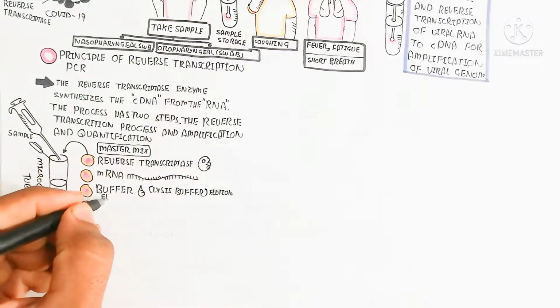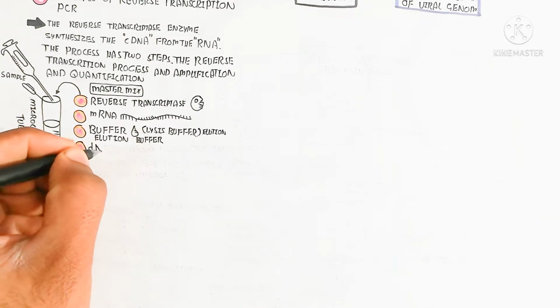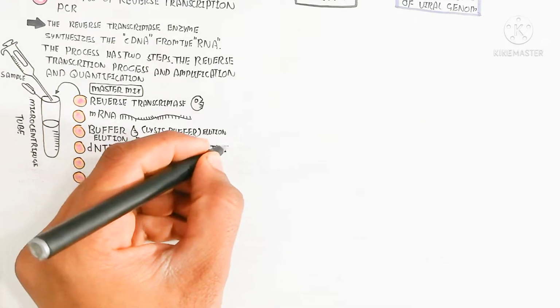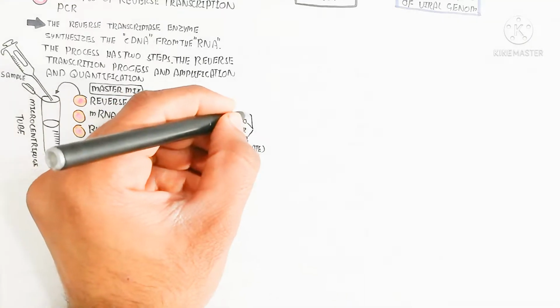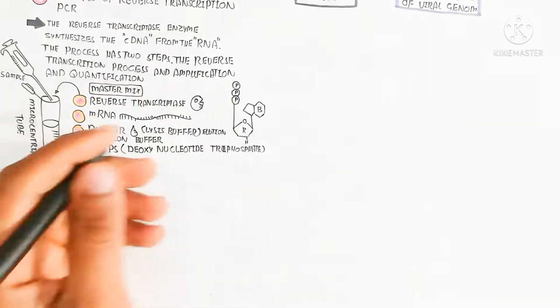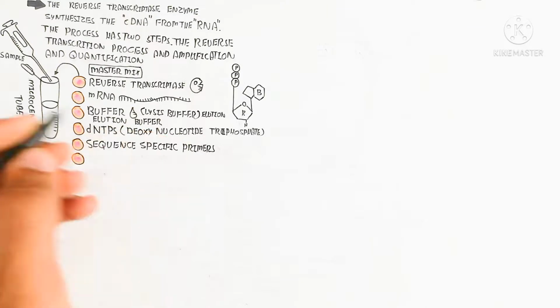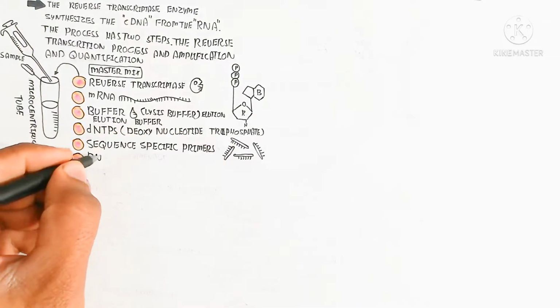That sequence specific primer binds with a specific region of the gene of the virus for the annealing process, leading to extension, and this extension will produce a complementary DNA. We can also add the DNA polymerase for the polymerization of the deoxynucleotide triphosphates during reverse transcription to become a complementary DNA double helical structure. So this is the first step, vortex.